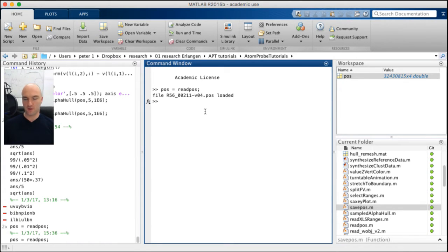Now, of course, the question is, we've got all the data loaded, but we just want to select a specific species or a specific range, as we call it. So I'll just call a variable MC begin, and we'll take it 26.9.